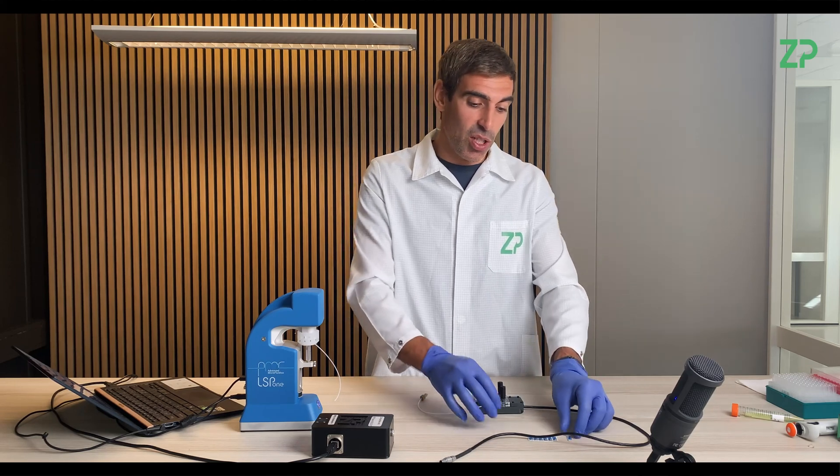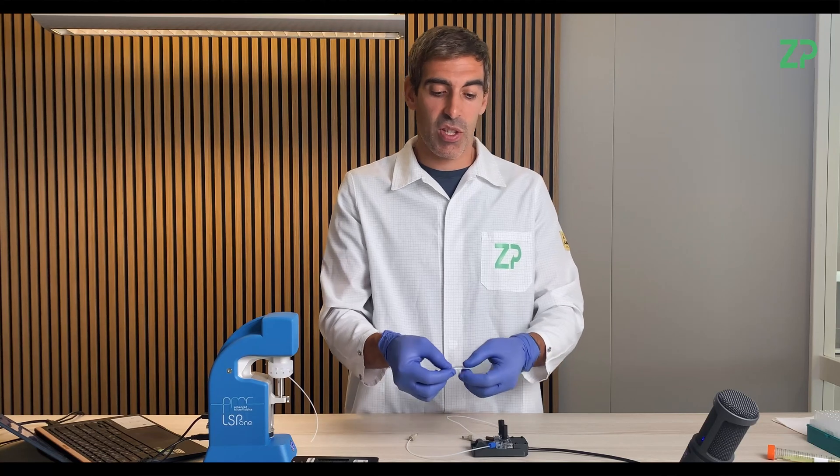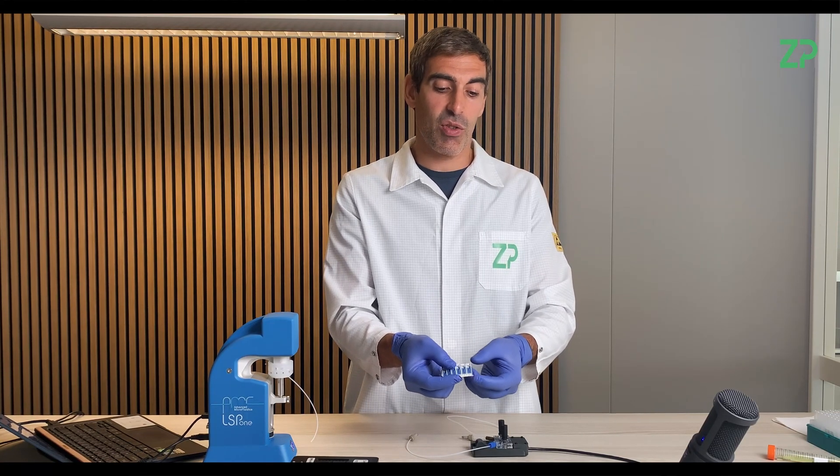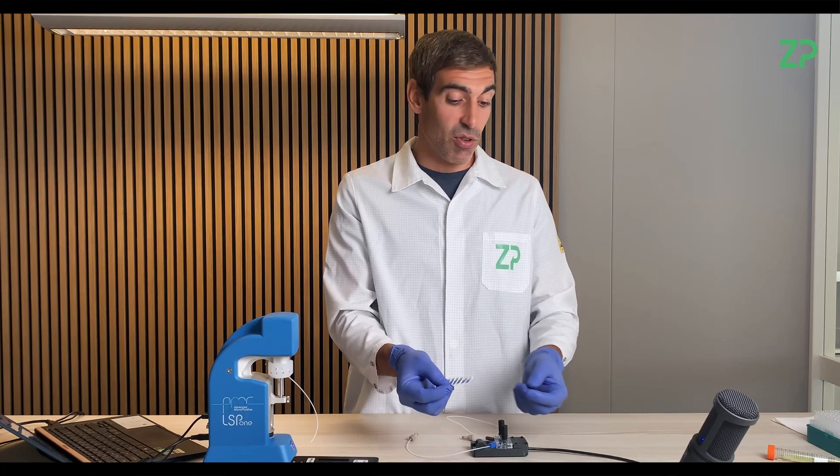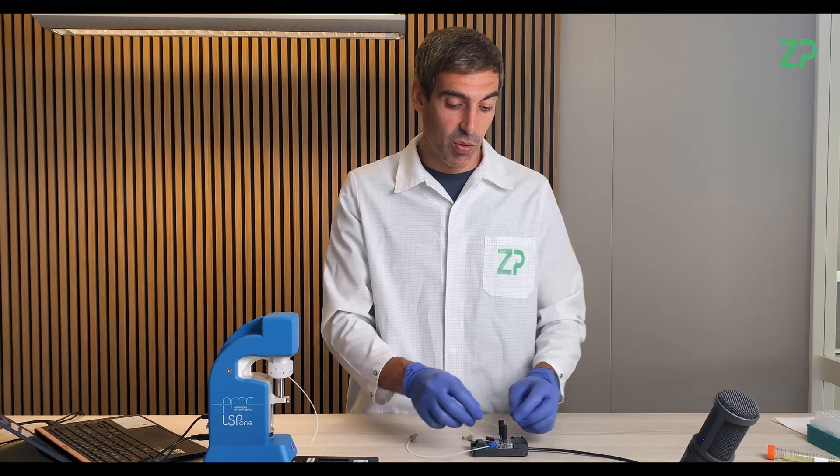In this instance, you need one of ZPE sensors. Here we are going to use actually one of these hypervalue sensors that are screen printed on a flexible substrate such as PE.